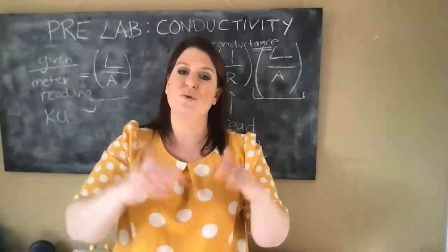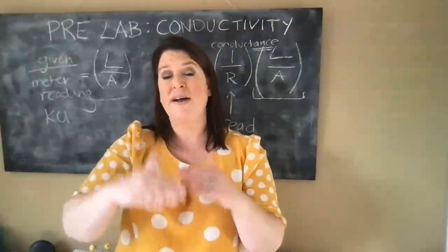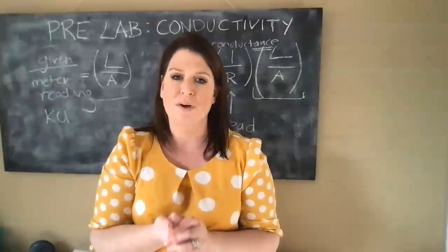So we're looking at fluctuations in conductivity, which are really only going to be dictated by the nature of the ions in the solution, not because we're comparing and contrasting different solutions. We're testing the same solution the whole time. So it's not so important.